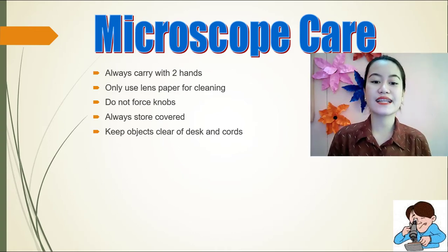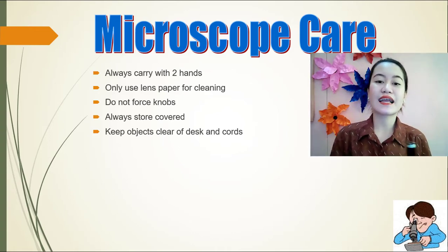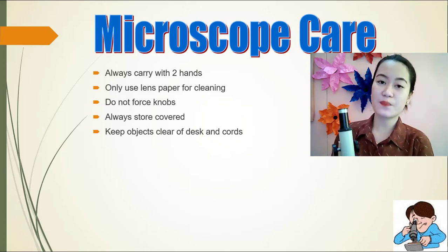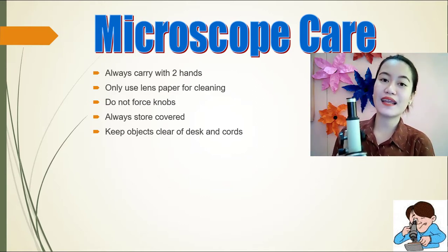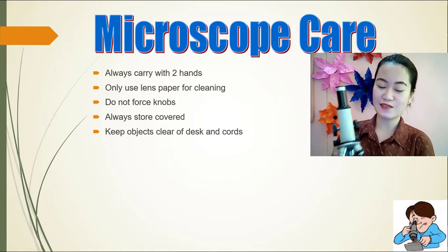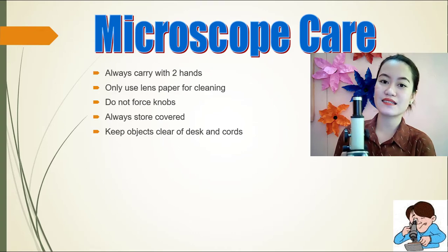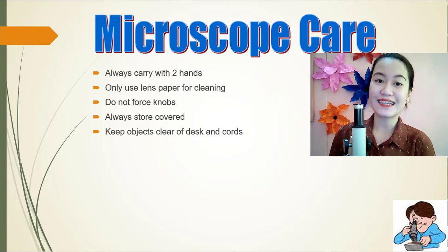keep objects clear of desks and cords. Kailangan dun sa paglalagyan mo nito, ay walang ibang laman kundi eto lang. Kasi pwedeng magasgasan yung mga lens niya kung hindi natin siya iingatan.